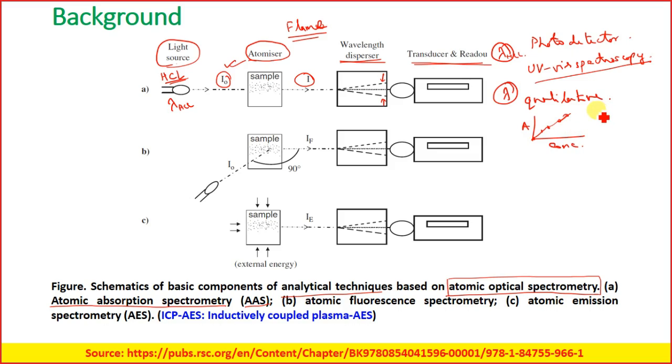The second one, if you see, is atomic fluorescence spectrometry. As the name suggests, it is similar to fluorescence.